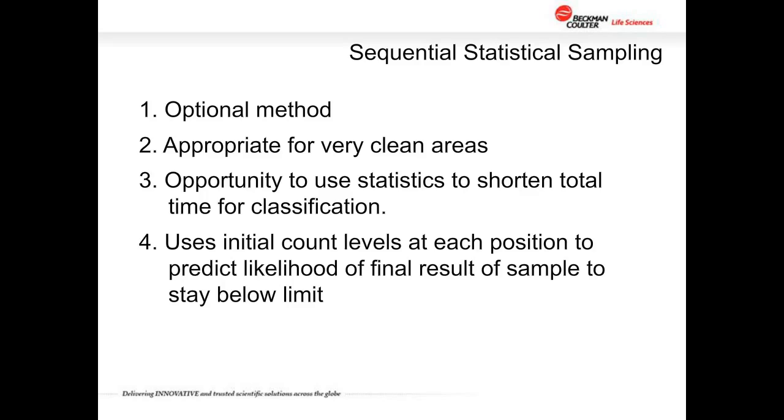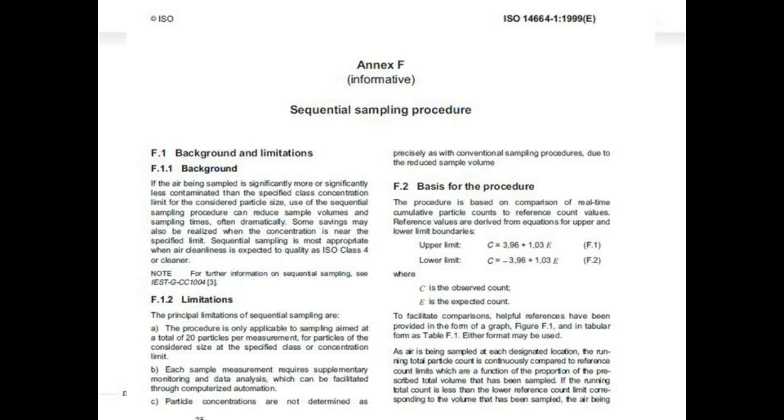However, because we're assuming certain consistency of the area over time, the sample point we're at doesn't change significantly over time, at least the time of the sampling. We're making a statistical assumption here in this method that we can quickly, by rate, figure out that we're going to pass or we're going to fail based on a few minutes of sampling. So this can be employed.